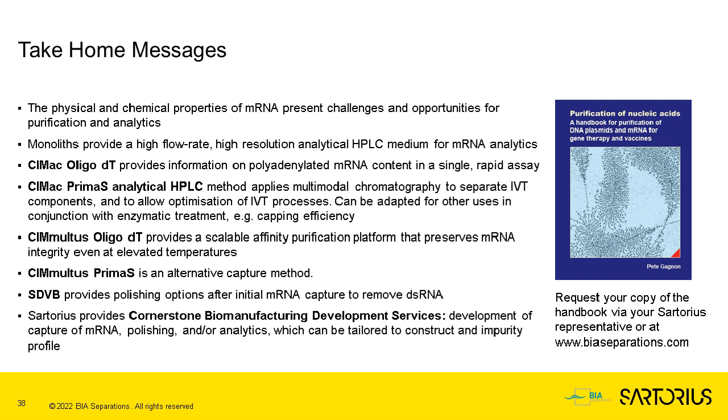First of all, does the method work for non-polyadenylated constructs? So I assume that the question relates to the Analytical Prima S method for monitoring the IVT productivity, and the answer is very much a solid yes. It works for polyadenylated, non-polyadenylated mRNAs. It works for other RNAs as well.